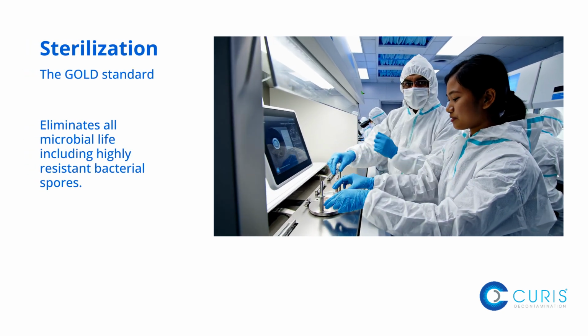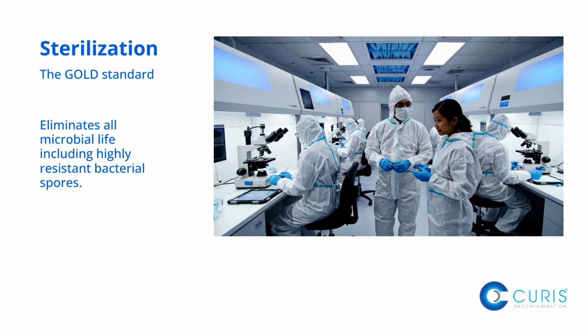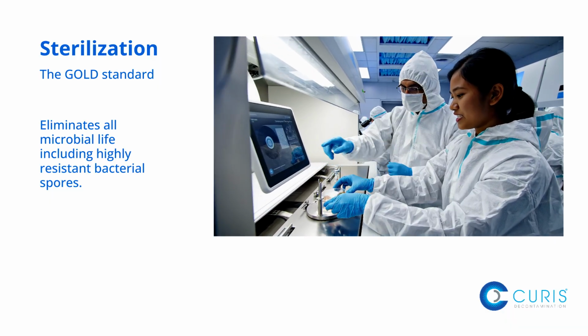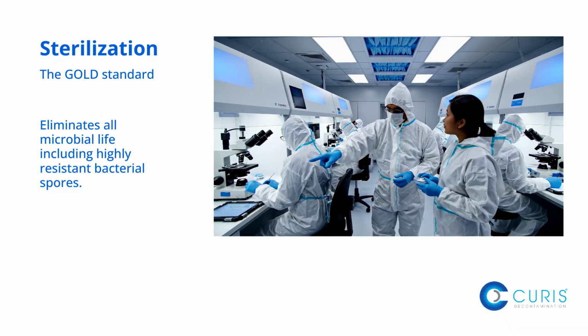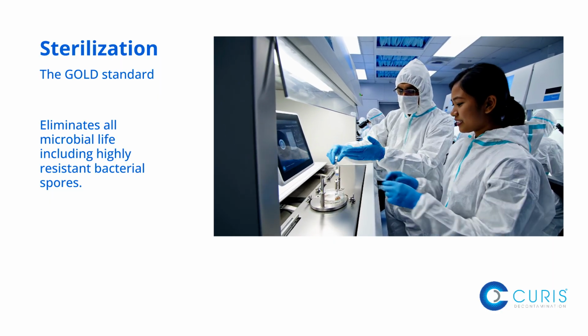Sterilization is the gold standard. It eliminates all microbial life, including highly resistant bacterial spores. This level of control is typically achieved through methods like autoclaving or advanced hydrogen peroxide vapor systems, and it's used when absolute sterility is non-negotiable.